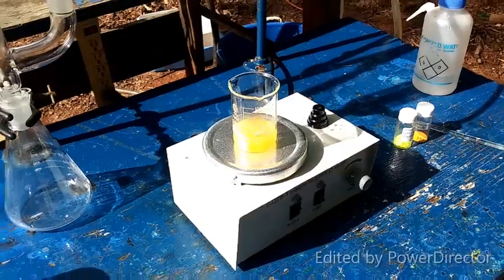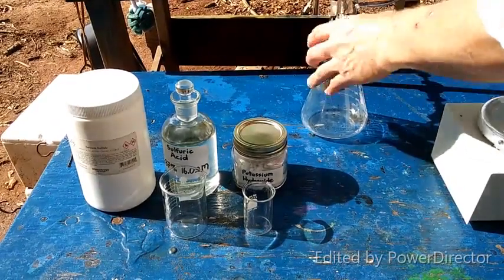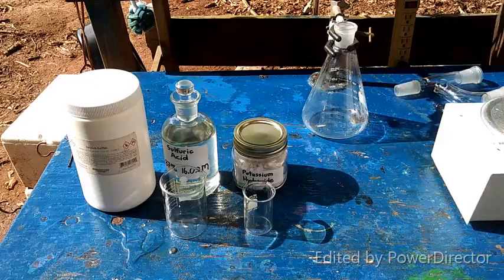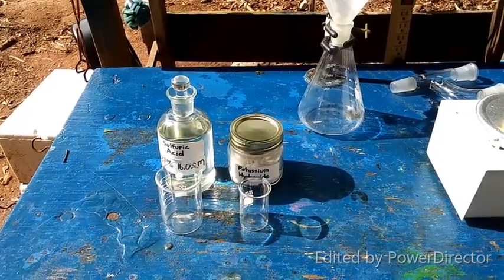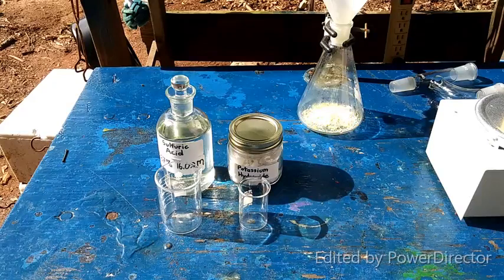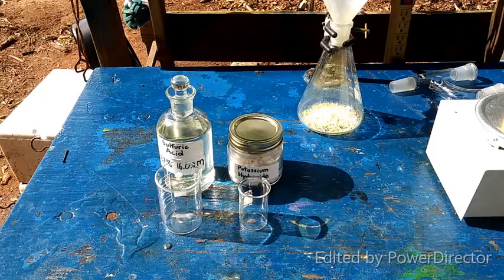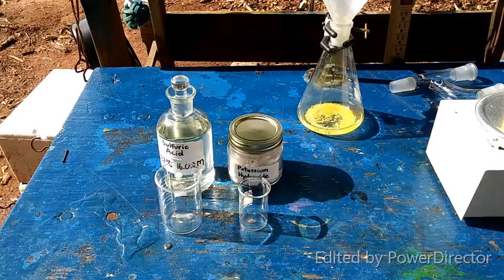While that's happening, I'm going to go ahead and make up everything we need for the hydrogen sulfide and the alkali. So for the hydrogen sulfide, we are just going to not break our glassware. Going to add some sodium sulfide. Not a whole lot. Doesn't need to be a huge amount or anything. That's about what I used last time. And let's see. I'm going to add some tap water to it and not use my distilled water.